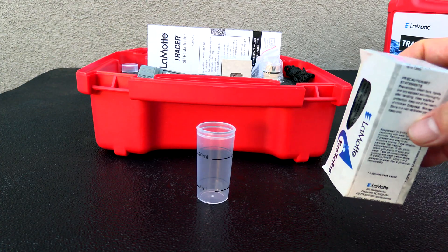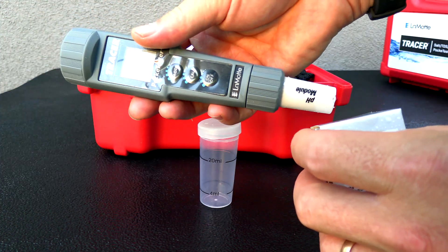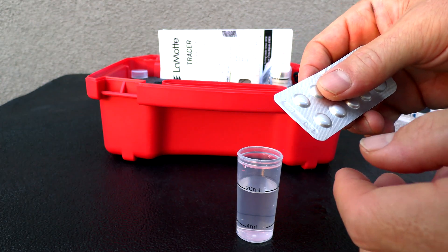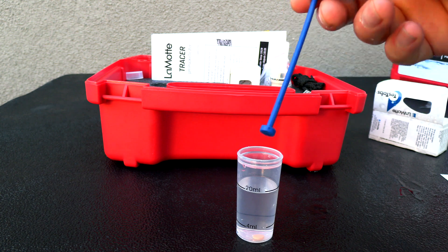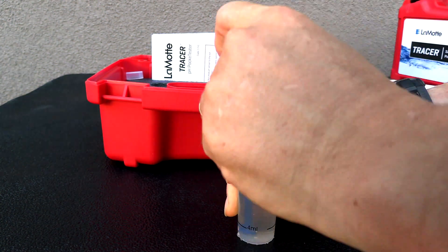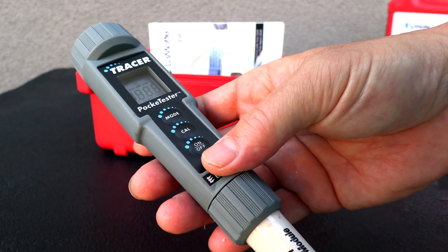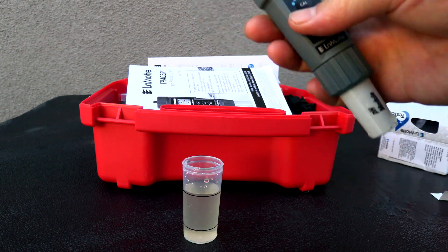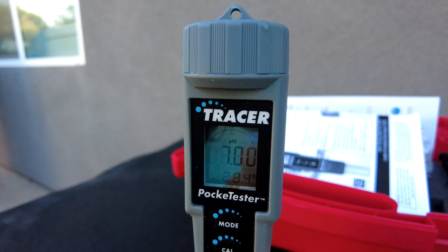The first thing you want to do is check to make sure that the PH is calibrated. I'm going to use a PH7 tablet. You can also use a PH4 tablet to create a solution to keep the PH module wet. Go ahead and put a PH7 tablet into a distilled water sample, then use the included crusher to crush the tablet. Turn the unit on, wait about three seconds for it to boot up, press the calibration button, and insert it into the solution.